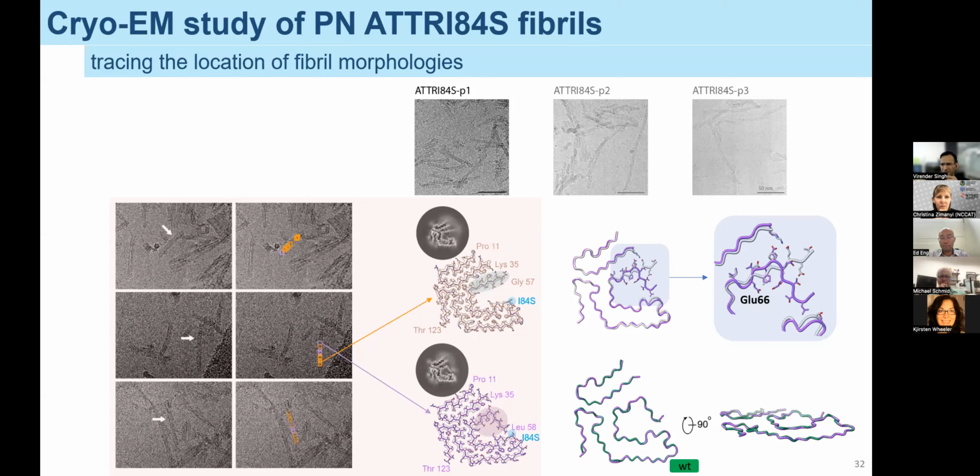And as you mentioned, if there are cases where you see fibrils with just this conformation or this conformation, in those cases we might not have to change any strategy, because you see those classes clearly. But nature has created these in a way that is very difficult to isolate with the normal pipeline.